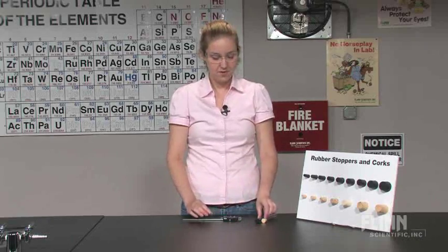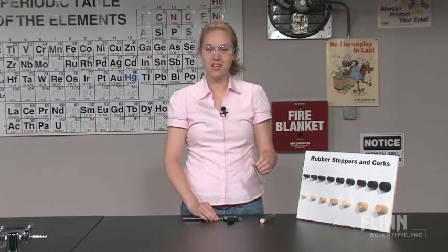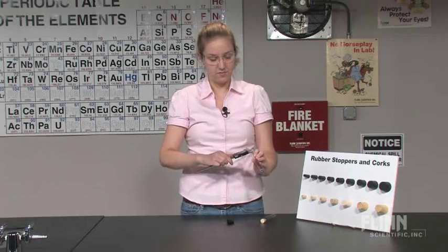The first step in determining the appropriate size stopper is to measure the inner diameter of your test tube using calipers.